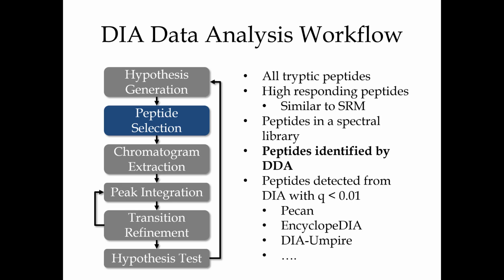The McCoss lab would say that you should do some pre-analysis and understand your samples. And I mean, you could start with Ben's library, but then we're gonna show you a technique where when you finally do the quantitative analysis, you're not necessarily just gonna query everything.